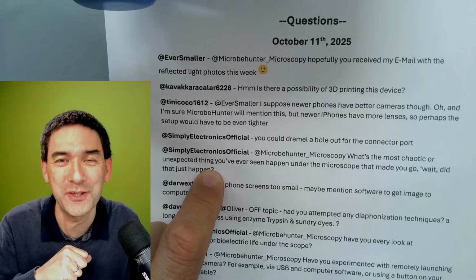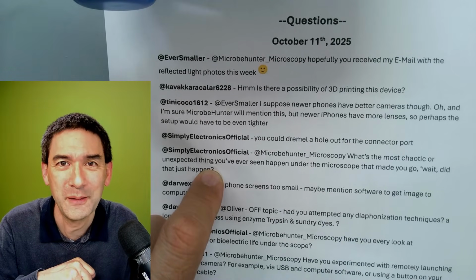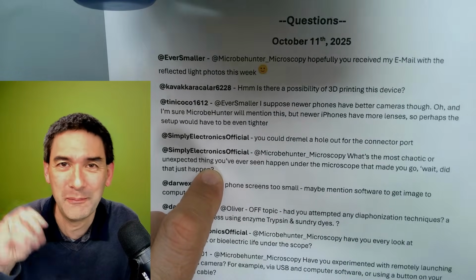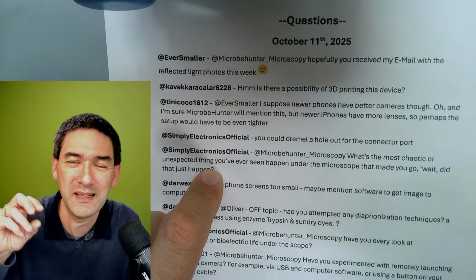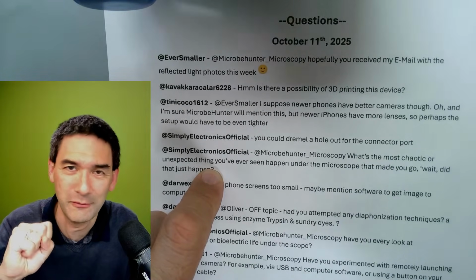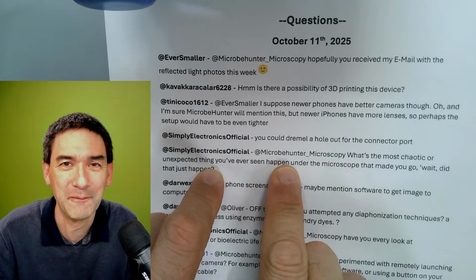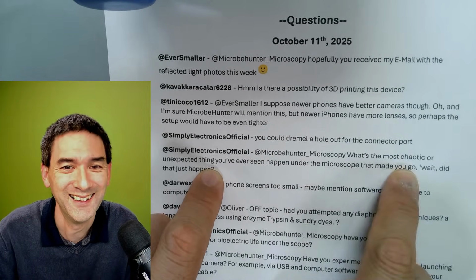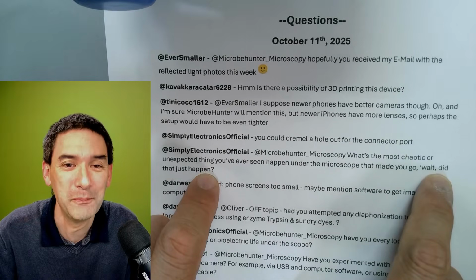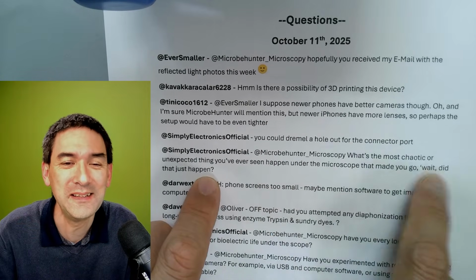And if you actually watch this hunting around for other cells, this guy's a pretty cruel hunter. I've seen it basically suck up a cell that was much larger than itself. Yeah, it punctured and swallowed it up. It was pretty dramatic. It was a very big coincidence, seeing a cell eat another cell.